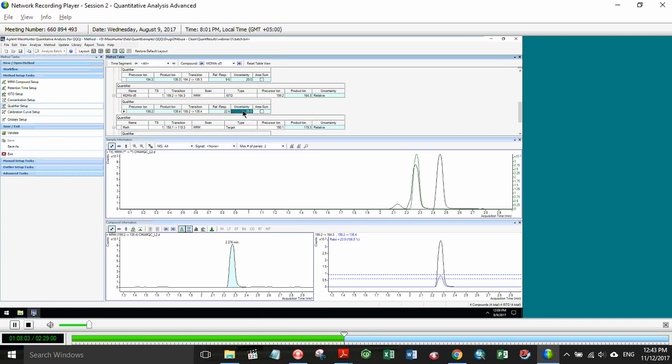Okay, do we have any other questions, Lindsay? The only other one I have is regarding the SDK kit. Is that available, free for users? That is available, again, in Quant B.08, the software development kit, SDK. It installs automatically, and it comes with Quant B.08. Okay, thank you.